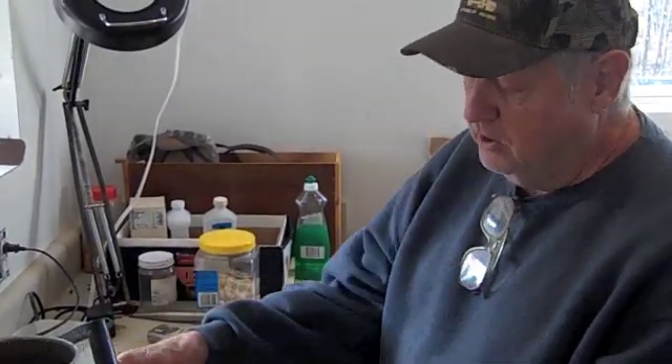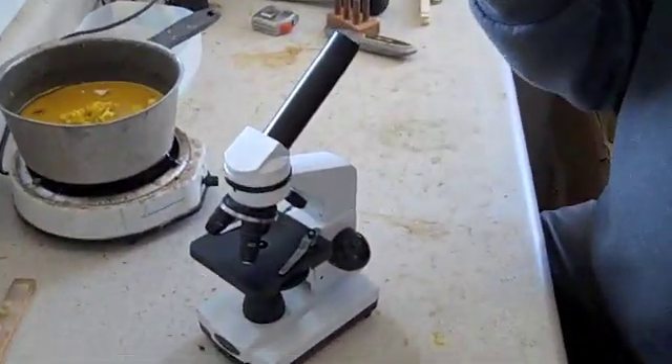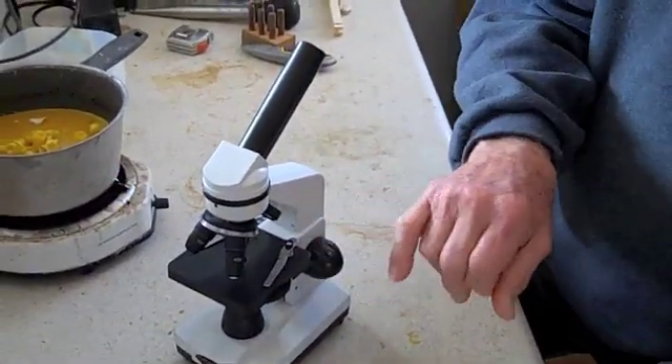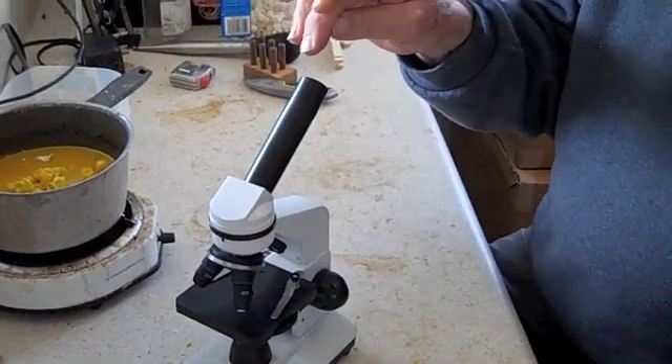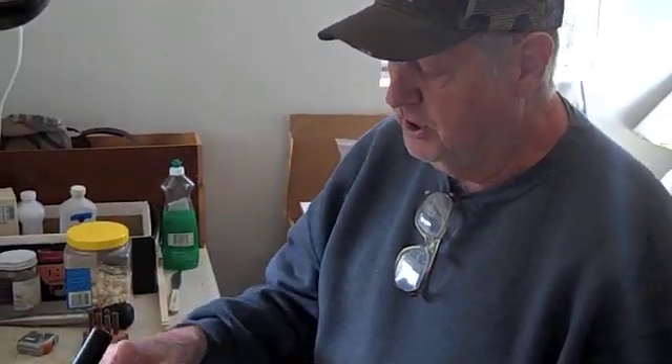I don't have the plates here right now, but you've got a little glass plate you can put here. You take a little swab and put it on that glass plate, and you can look under the microscope and see actual spores of the nosema. Very easy for the average person to do.